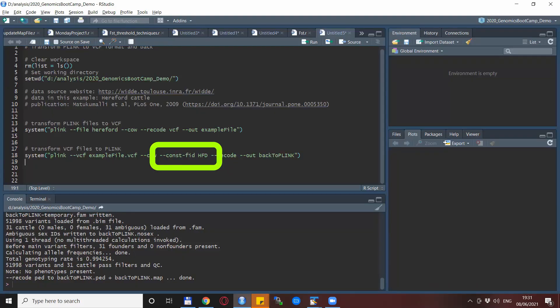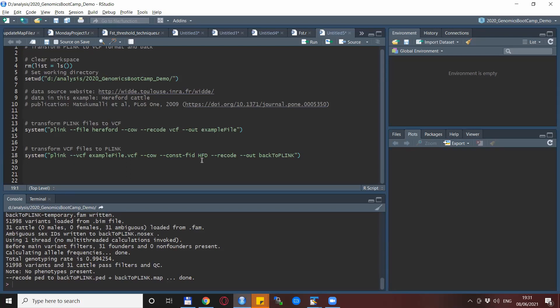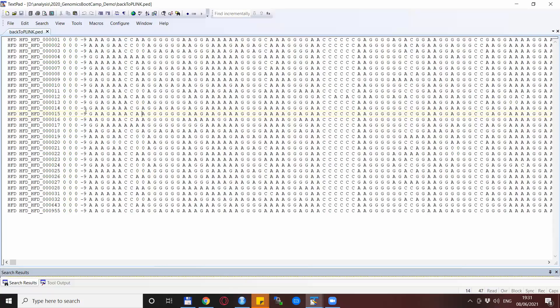Personally, I like the other option using the constant-FID better. So in this case, you have actually the option to specify any family ID that you desire. So in our case, I put it back to HFD for the Hereford. After we run this, we get the FID exactly as we specified for each individual. If you don't specify anything, there would be a column of zeros at the very beginning of the ped file.